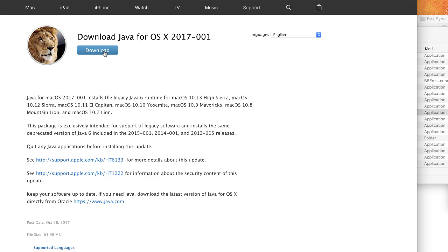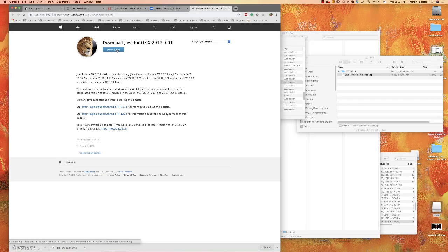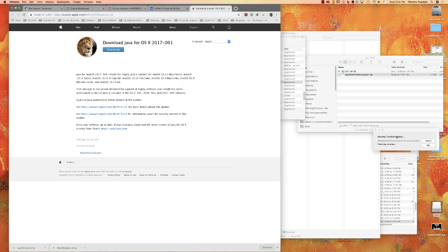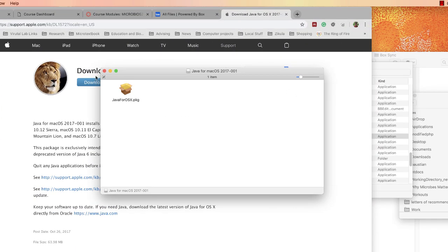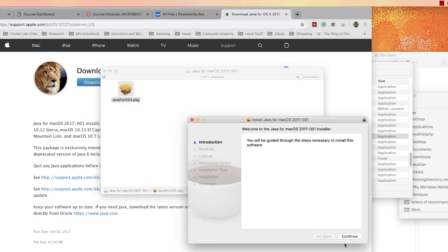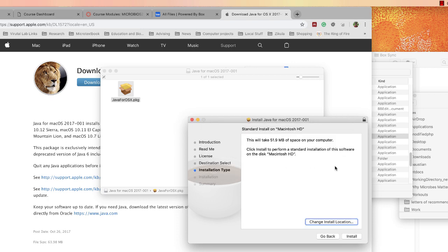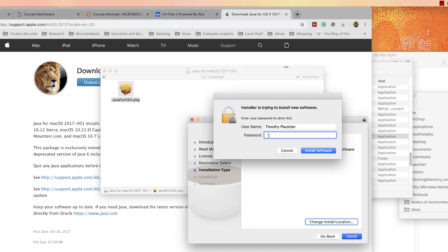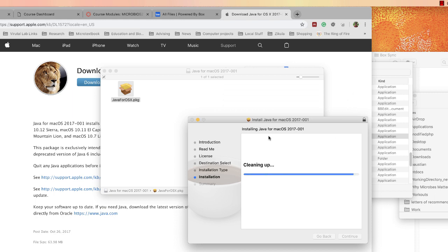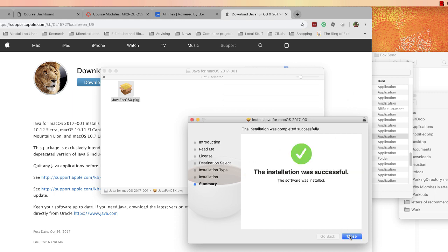So you download this older Java. I don't think you need to do this on Windows — on Windows you need to install Java and it will tell you to do that. Now double-click on this. It's opening the Java for OS X DMG. I launch the Java for OS X DMG package. Say Continue, Continue, Continue, Continue, agree, Install, then type my password. It now installs it onto the disk and says it's successful.